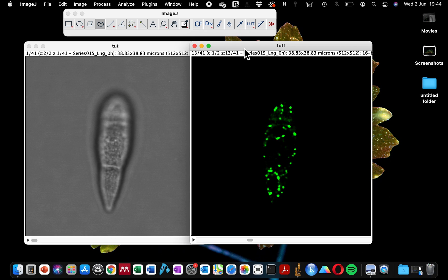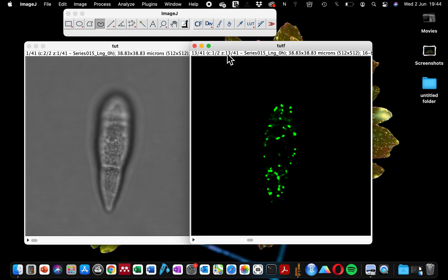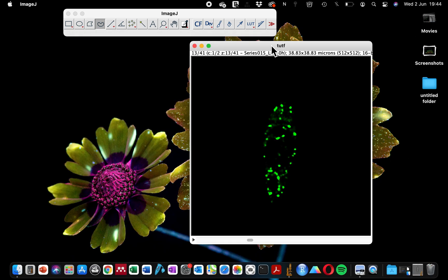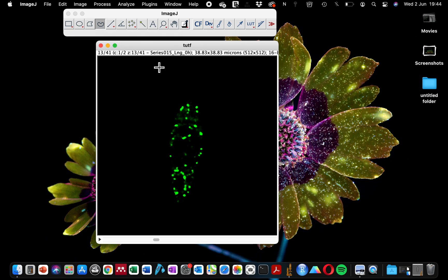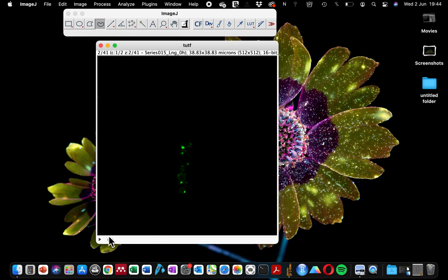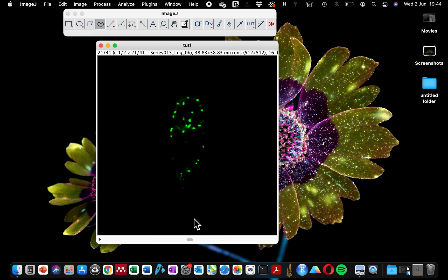For today's analysis, we do not need a bright field image because we want to see through our fluorescence image that we want to color code.